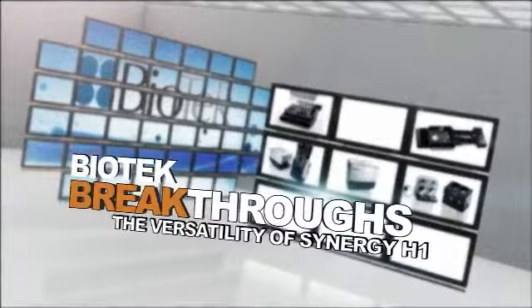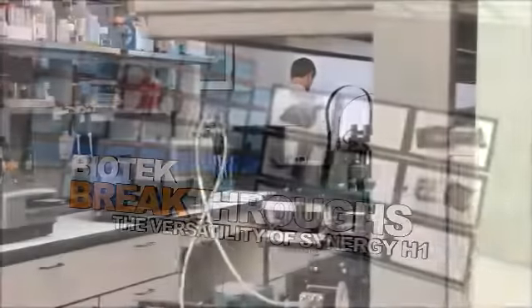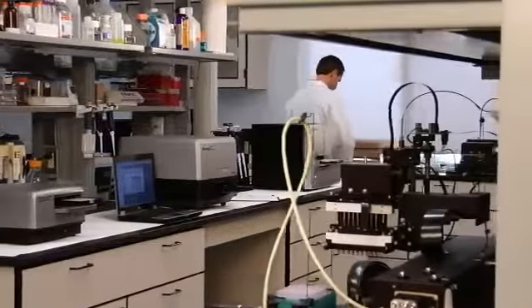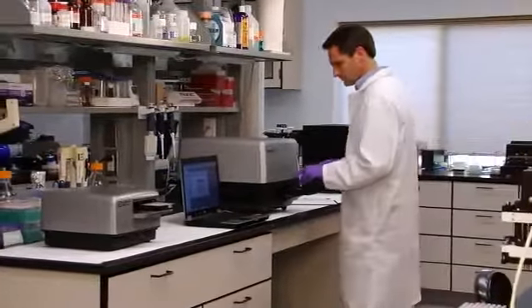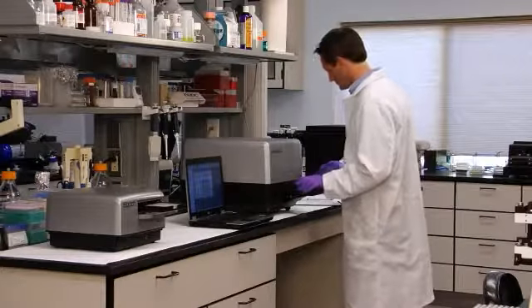Welcome to another biotech breakthrough. Today's researchers expect multi-mode microplate readers to cover the broadest possible range of applications while being sensitive and easy to use.